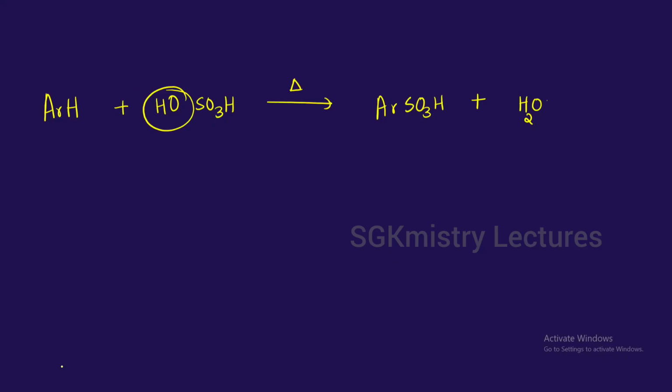So now the next step we have to perform is to check if a halogen-substituted hydrocarbon is the one which is given. Already, if you have observed that chlorine was present when you did the test for halogen under the Lassaigne's test, and also if a green-edged flame was obtained when you did the ignition, the copper wire test, then we can say that it may be a halo-substituted hydrocarbon.